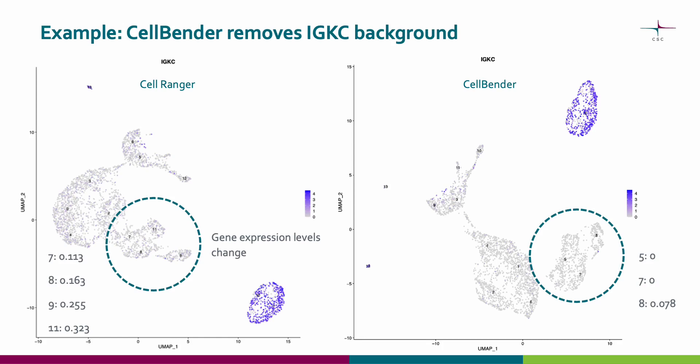This is, however, just an example, and for this dataset it may not make sense to actually remove background contamination. Remember that CellBender might be useful when a high amount of contamination is present.